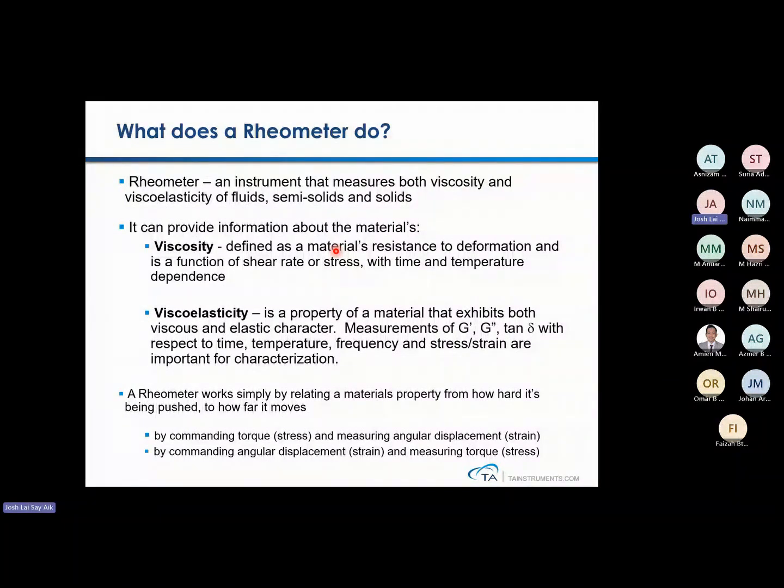A rheometer is very simple. To be honest, you just have to command how much stress is required to apply to a sample, and it will try to achieve the certain strain that you require. So running the rheometer is very simple. What is most challenging is to interpret the data.